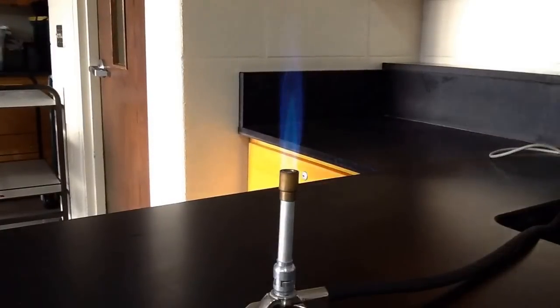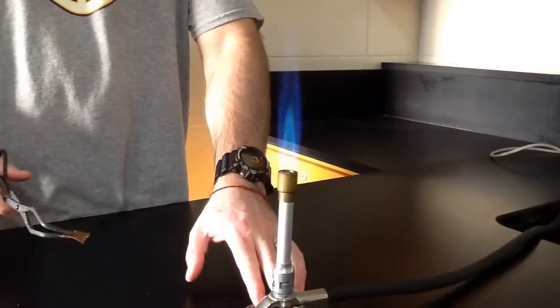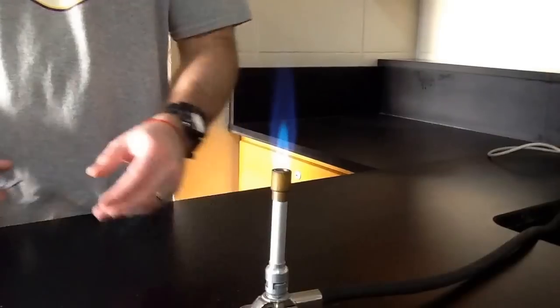Hey, good morning everybody, it's Mr. Mott and Mr. Scott. We're going to be showing you guys our types of reactions. We're going to start out, we got our Bunsen burner on, nice blue flame.